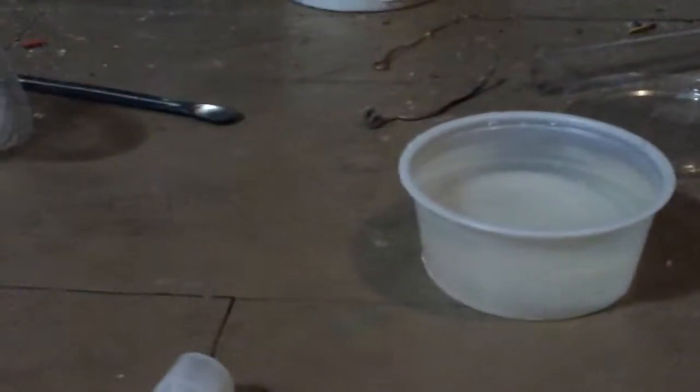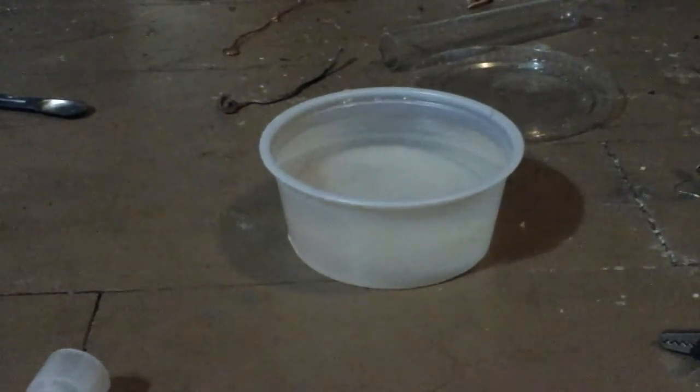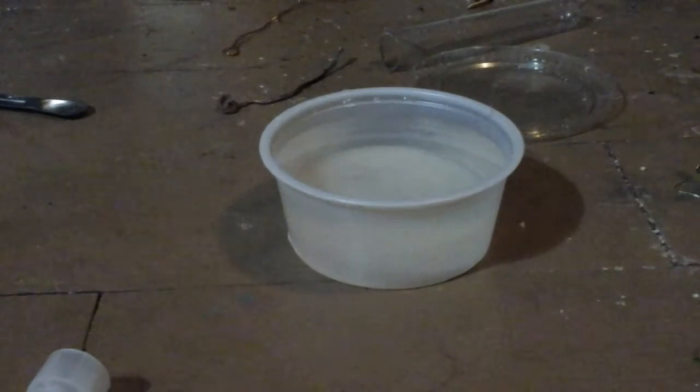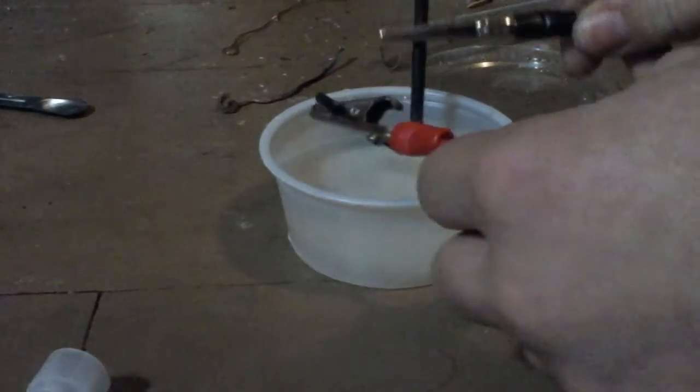I'm just going to set my tablet down and slip it in the little holder thing. I also have a lighter. Basically, the negative electrode produces hydrogen and the positive electrode produces chlorine, so you've got to stick both cathode and anode in there.